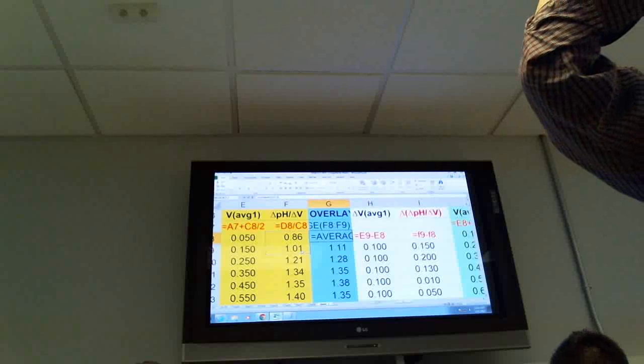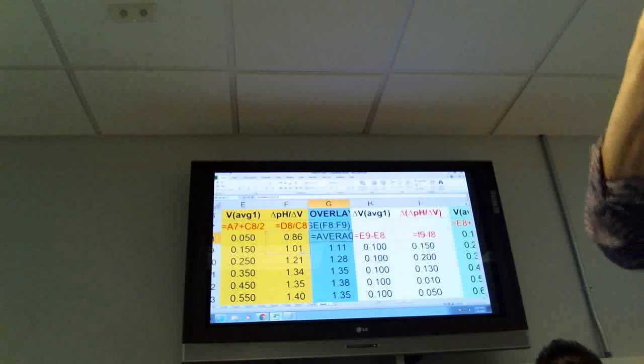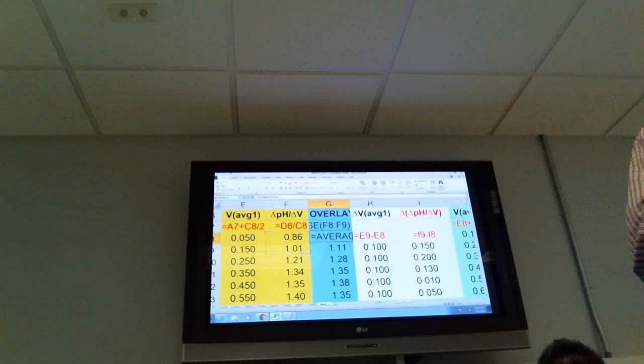Are you guys following me? And so this is why there's all this weird offsetting going on back and forth, because I don't have data at those specific X values in order to do an overlay. Now, if you're not doing an overlay, then forget all this offsetting stuff. You don't have to do this.